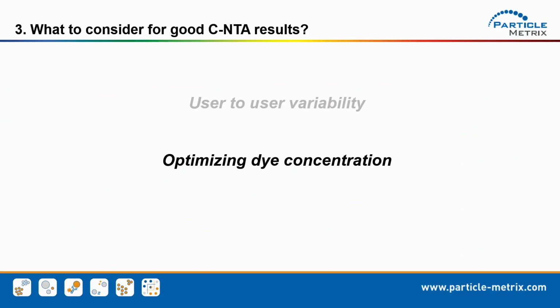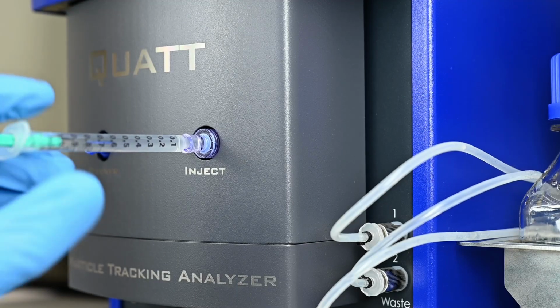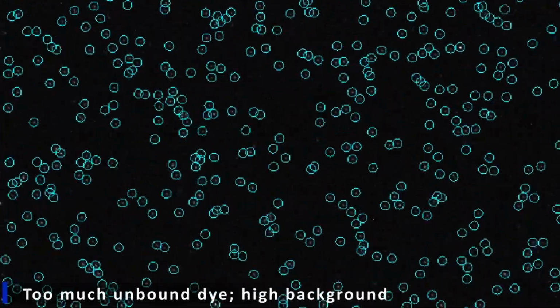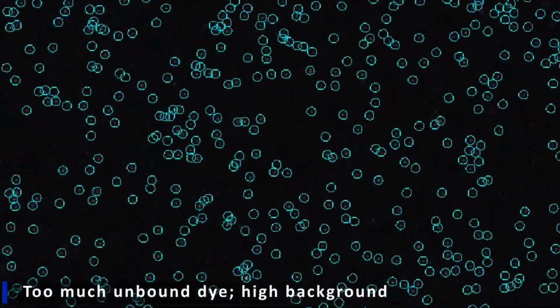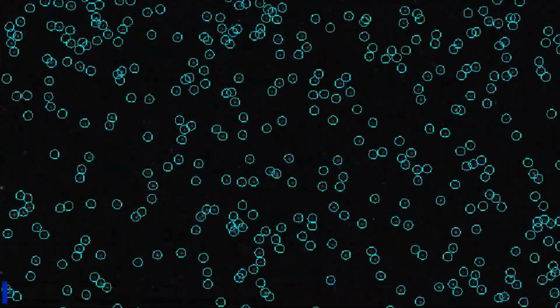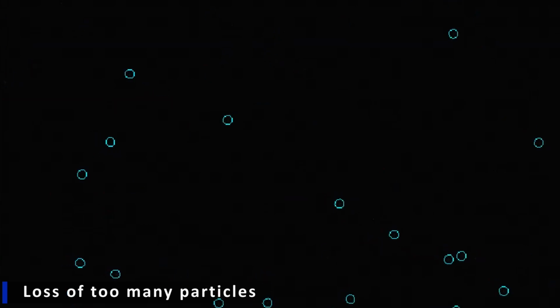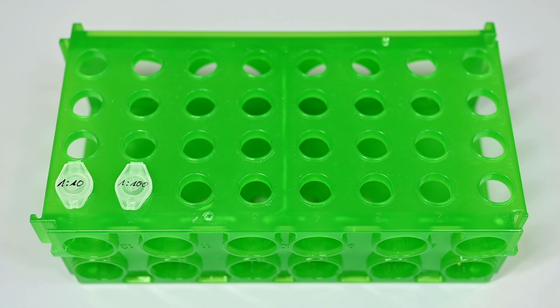Another key point to pay attention to: optimizing dye concentration or low signal-to-noise ratio. What does it mean? Staining with fluorescence means adding dye in excess, which in turn means a high amount of unbound dye. Ideally, you wash all free dye or antibody away, but you are working with very small particles, and compared to much larger cells, they have a very limited number of antibody binding sites. So washing would cost us a lot of time and we would lose a big portion of particles of interest. The solution is to test several dilutions of the dye or antibodies.